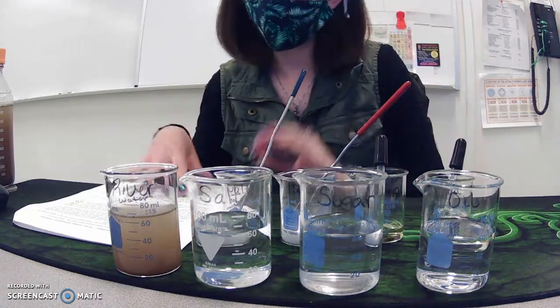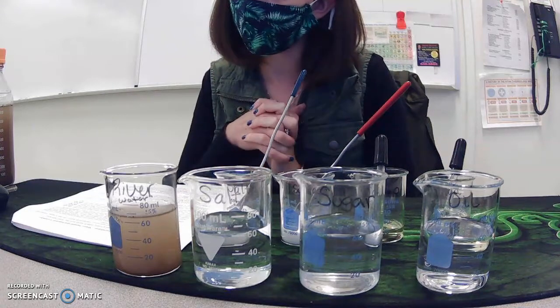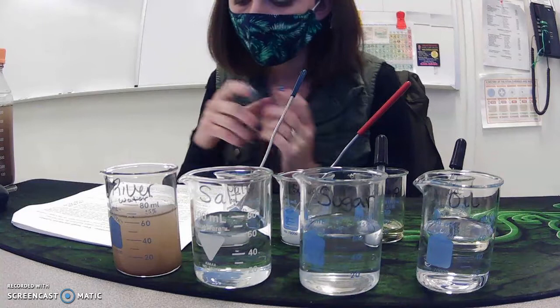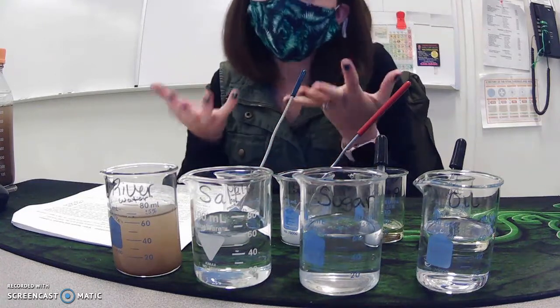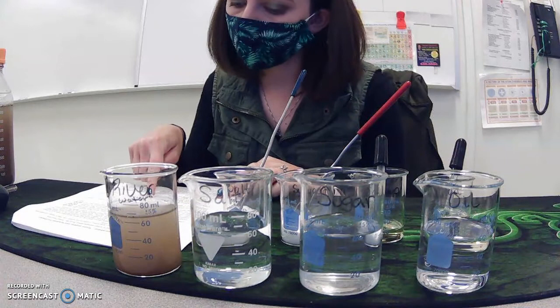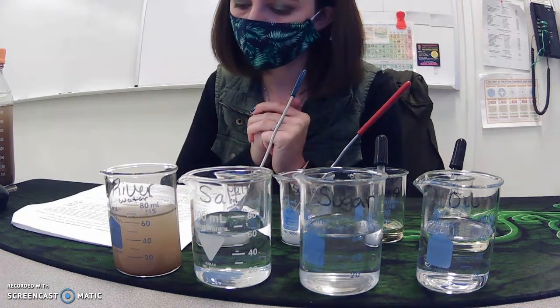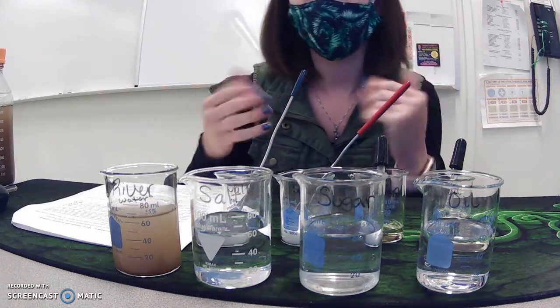In the first one, it says oil is a nonpolar hydrocarbon. It says add a few milliliters of oil into the 1 beaker of distilled water. We want to describe what we see. How can we tell that this is a nonpolar molecule? We're going to use the glass stir rod to stir it in to see what's going to happen as the oil appears. Does it mix? Is the oil still visible? What can we see happening?